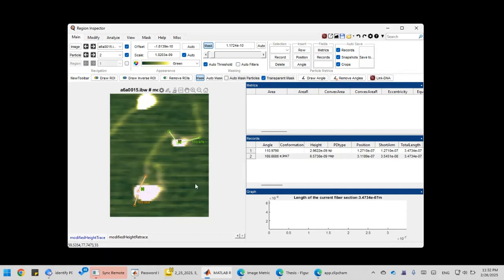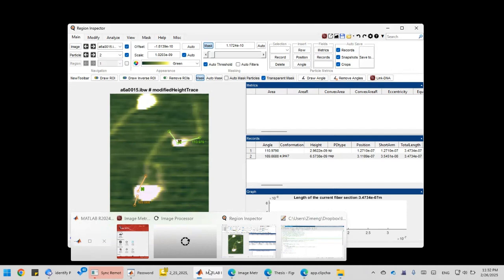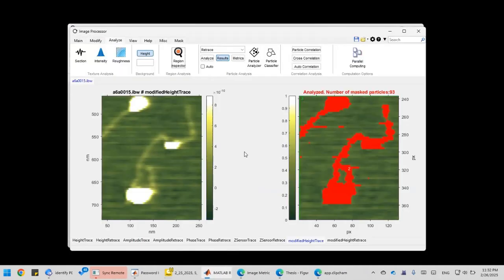So just click add. It will be in your new set. So yeah, let's go back to my main image. Let me show you the set that I already added. So this is the image that we have seen, this complex. Now we are at the retrace particle set, and not the default. That's a mistake I mentioned earlier. So now let's go back to the PD complex set.